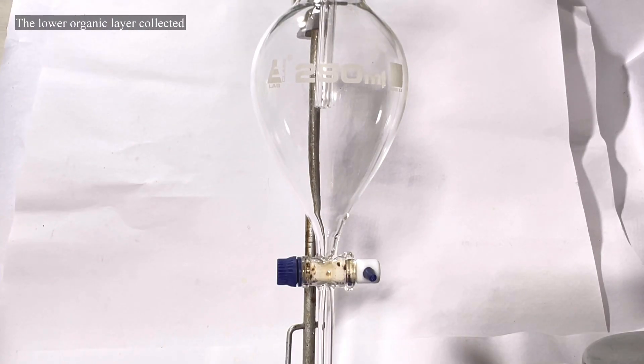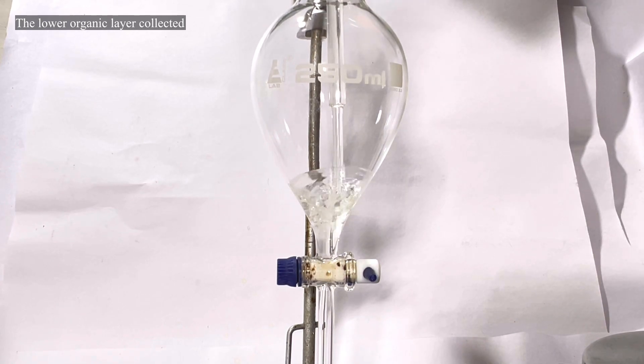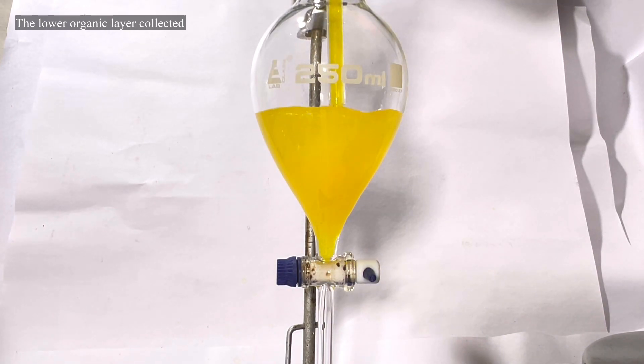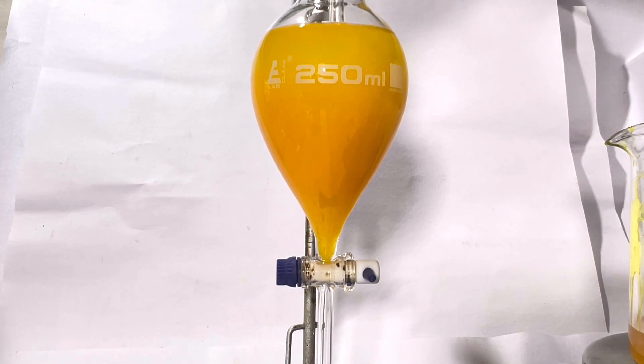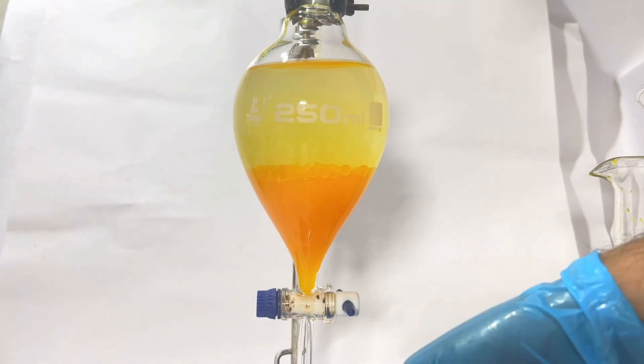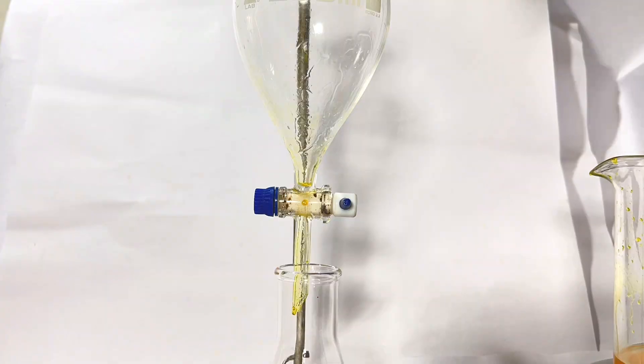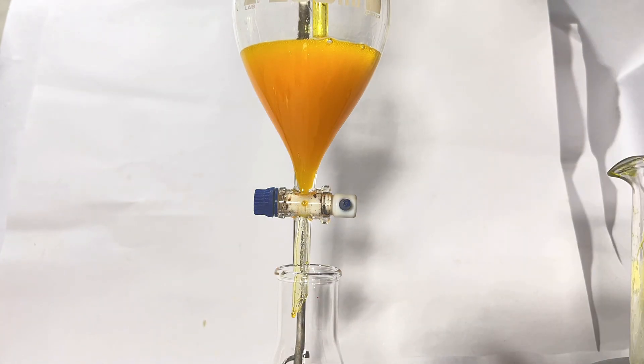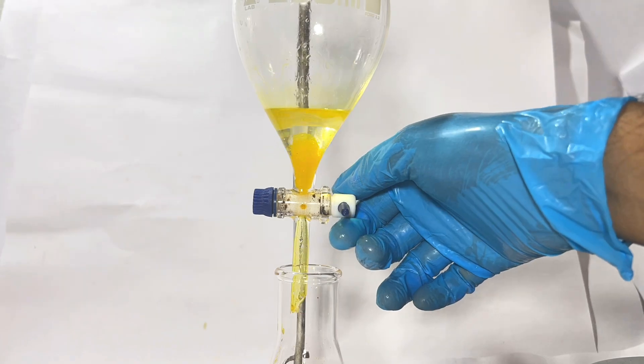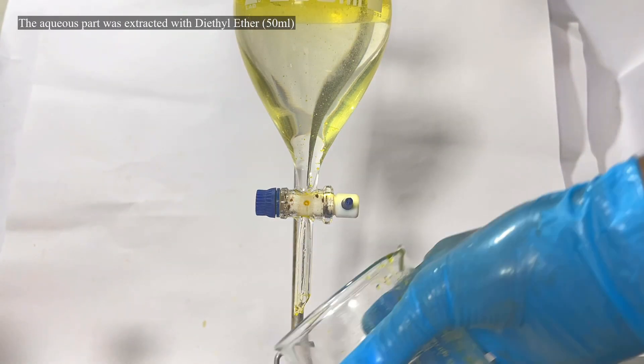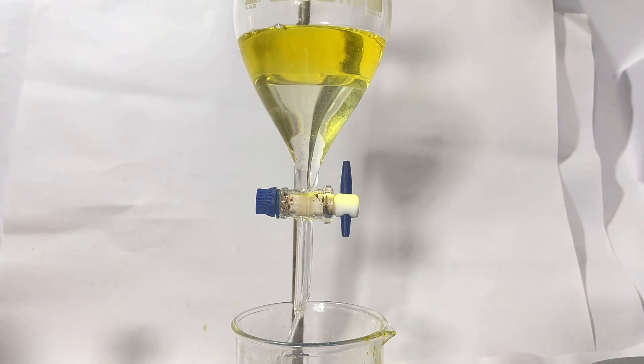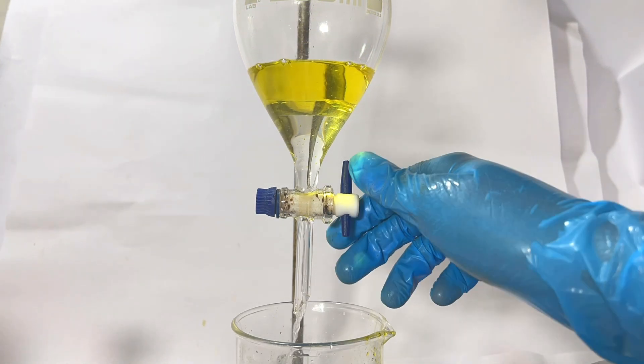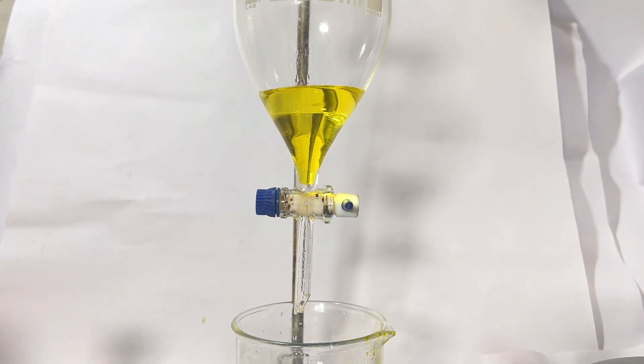The organic layer contains a mixture of unreacted benzaldehyde and cinnamaldehyde. The aqueous part was then extracted twice, each time with 25 ml of diethyl ether and the ether layer was transferred to the crude mixture of benzaldehyde and cinnamaldehyde.